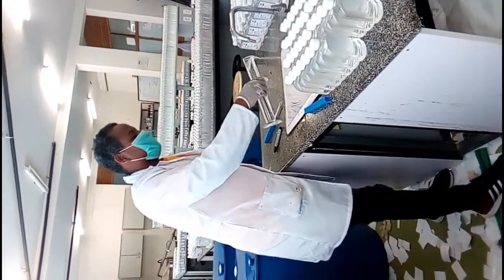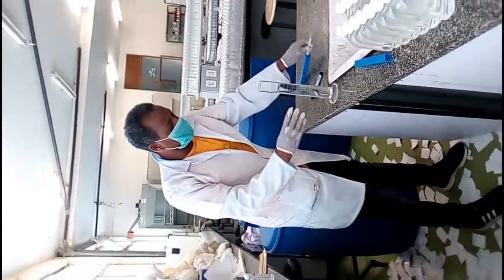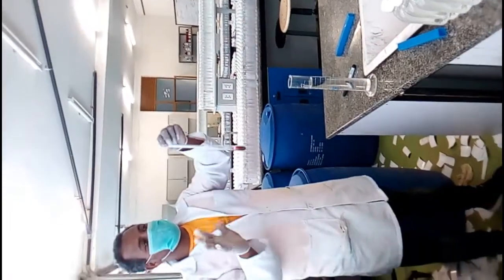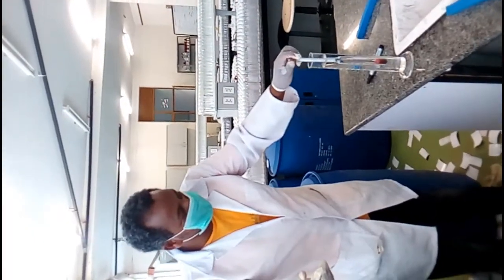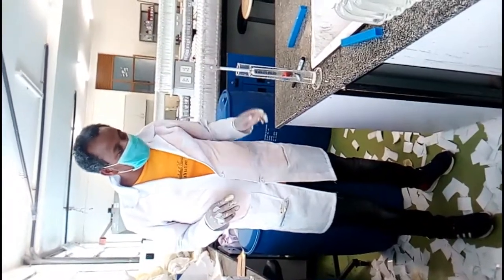Okay, I'm sorry. Let's make it like this. This one is approximately this water. We are going to check the principle of this alcohometry, whether it contains alcohol or not. Let's come to here. Yes, here I observe like this. I'm sorry for this.